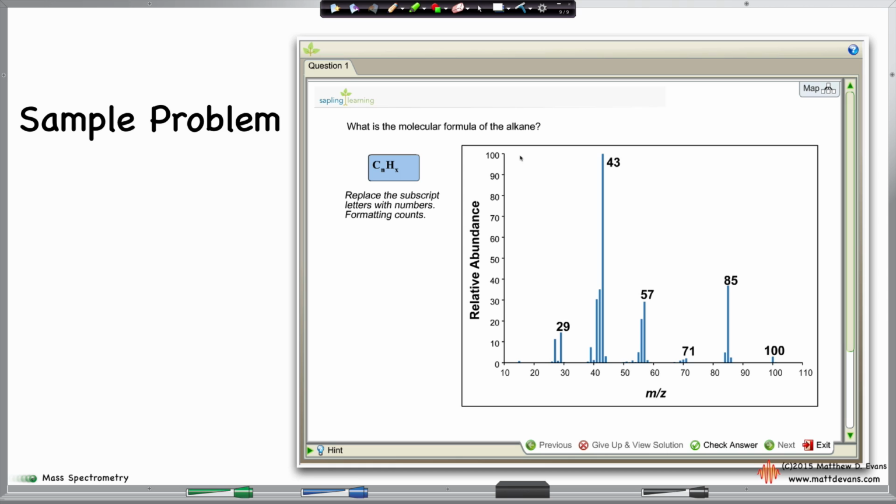This is something you're really going to have to get good at in terms of our interpretation of mass spectra. In fact, it's going to be more than this; we're going to have some other spectra too, but you need to figure this out quickly. So the parent peak, of course, is going to be the rightmost peak. This is the parent, and that's the interesting one. In fact, the base peak isn't going to be so useful to us. It's the parent peak: parent peak 100.